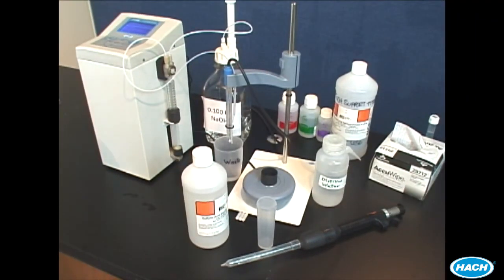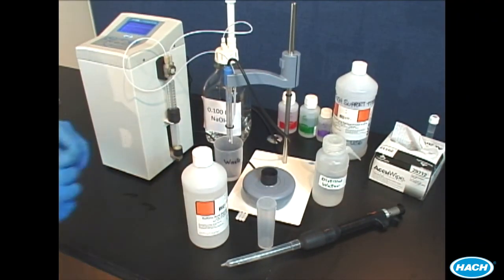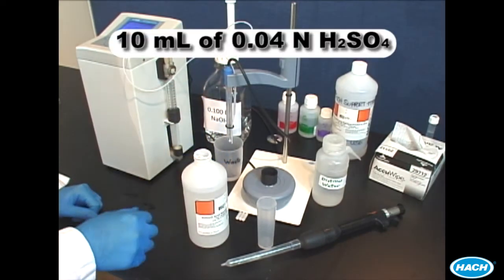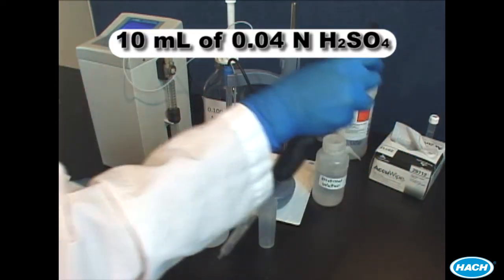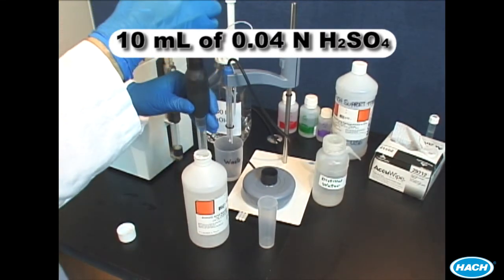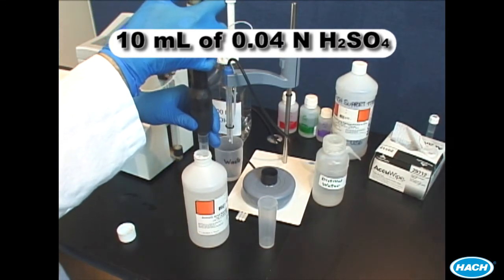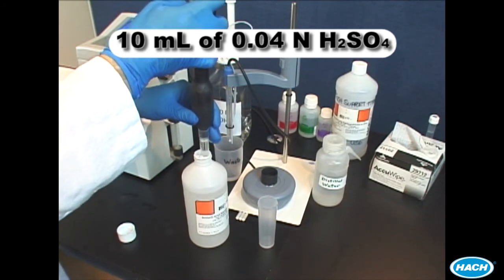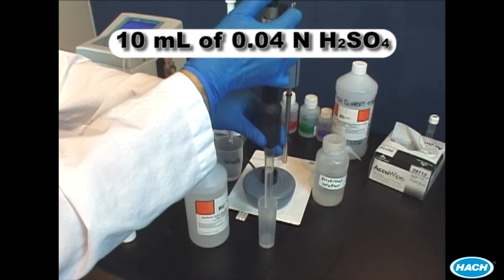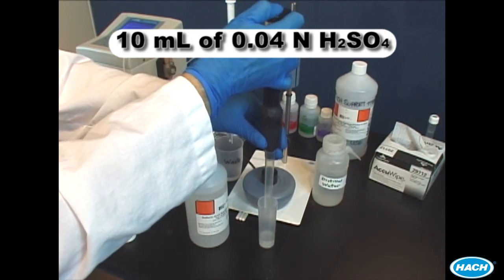You are now ready to measure your sample. For all titration models we are going to use 10 mL of 0.04 normal sulfuric acid standard. Some titration models prompt you for a weight instead of a volume, in which case you will enter 10 grams since 10 mL weighs about 10 grams.